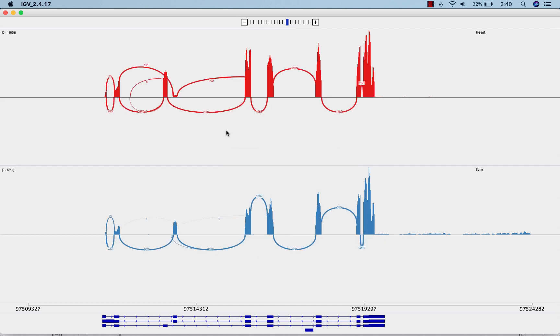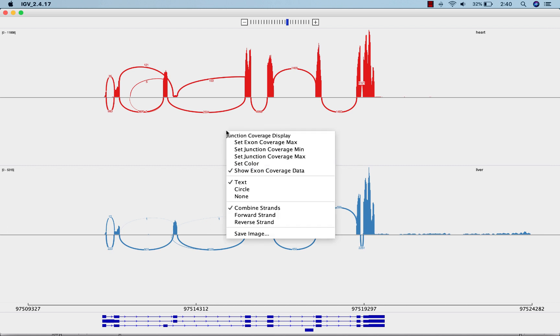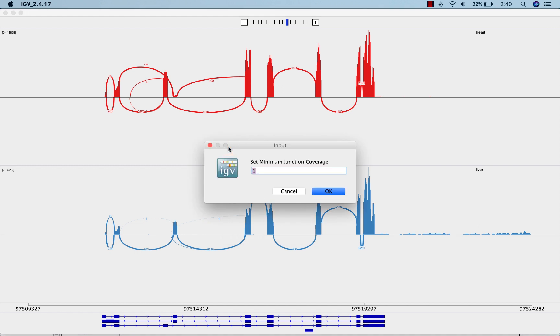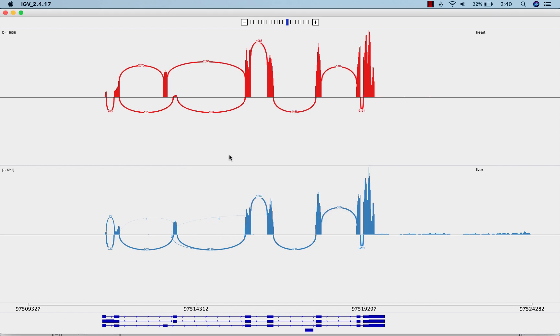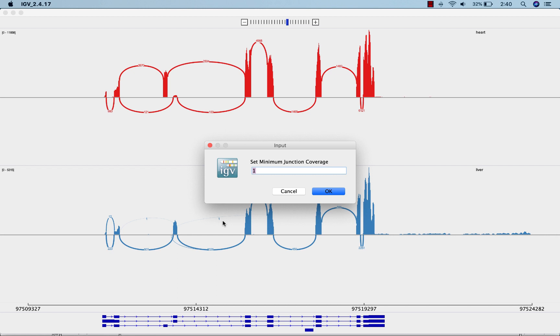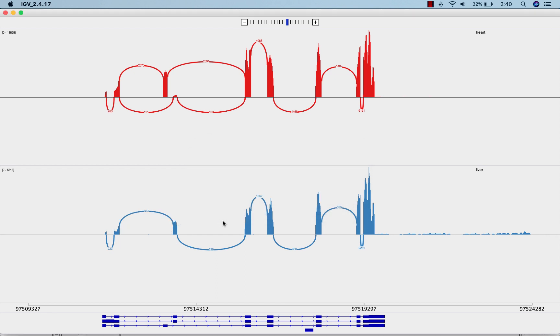Now let's say we don't care about junctions with low coverage. What we want to do is right-click and set a junction coverage minimum. When we set the junction coverage minimum to 50, we see fewer junctions shown, all of which have a coverage equal to or greater than 50. And if you want, you can set the junction coverage maximum in the same way.